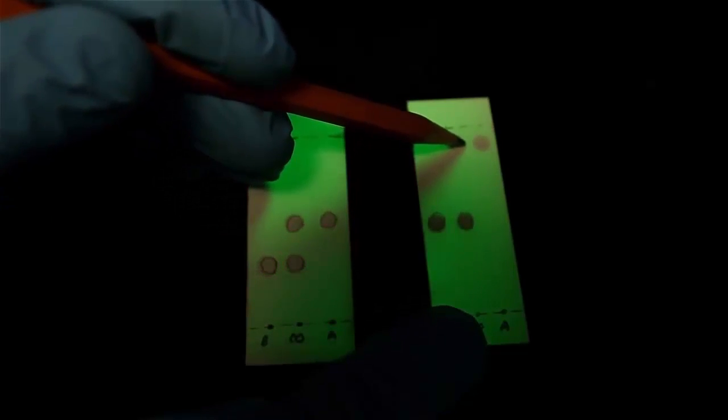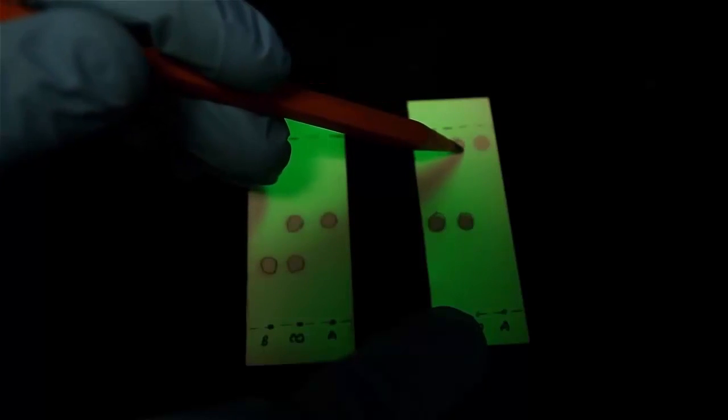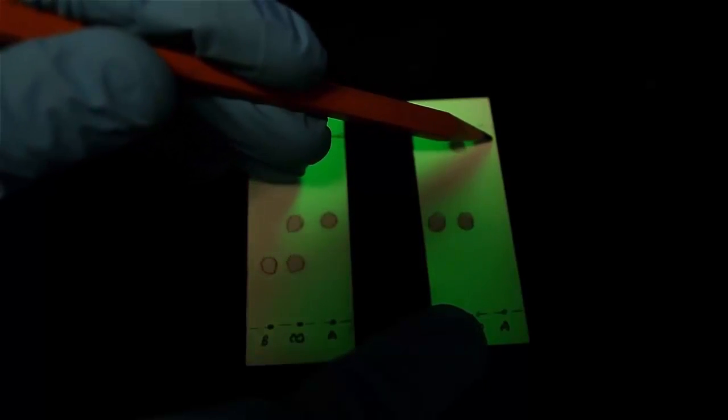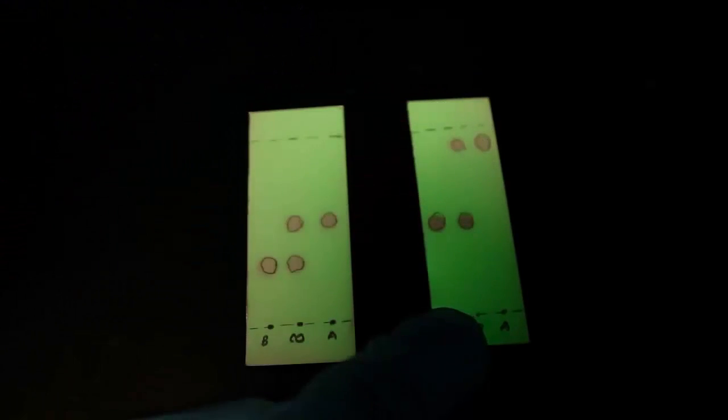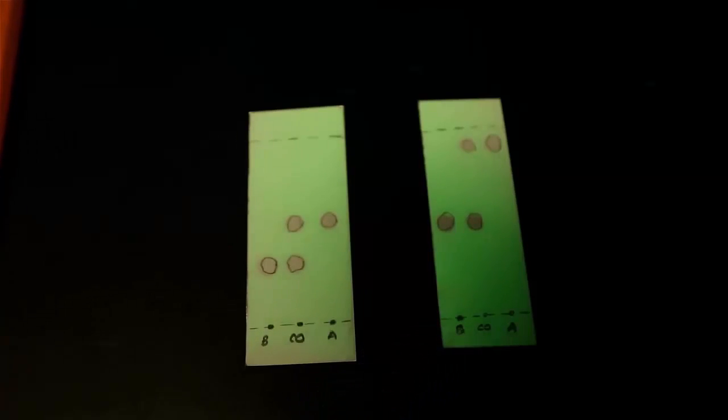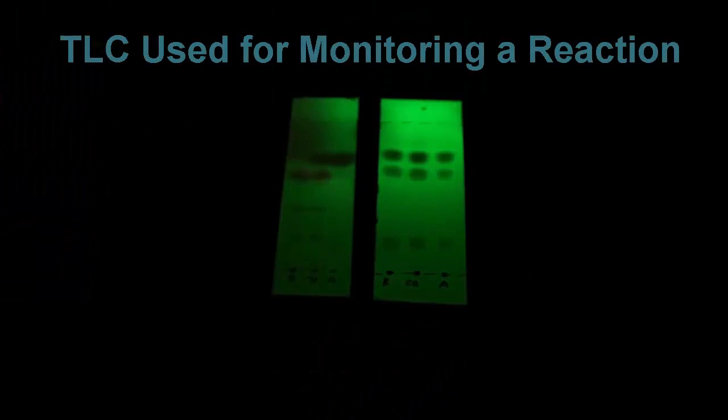Any good TLC plate will have a co-spot. It serves as a reference point and a comparison for your product and your starting material. Also, it is an indication as to whether or not your TLC plate was made correctly. If properly made, the co-spot should have one spot for each corresponding sample.